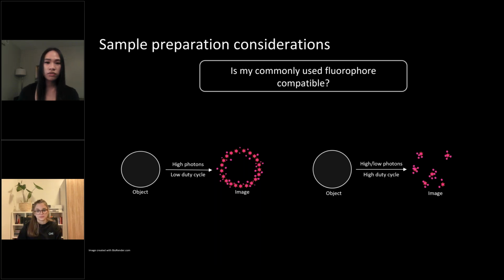We do have a list of fluorophores for dSTORM and PALM. That's on our website. Also, if you just want to reach out to one of your representatives, we can send you that list as well.